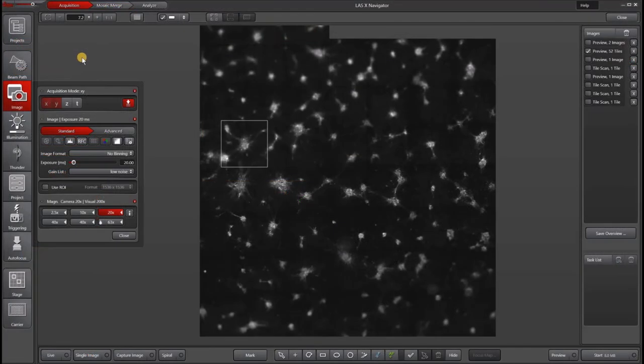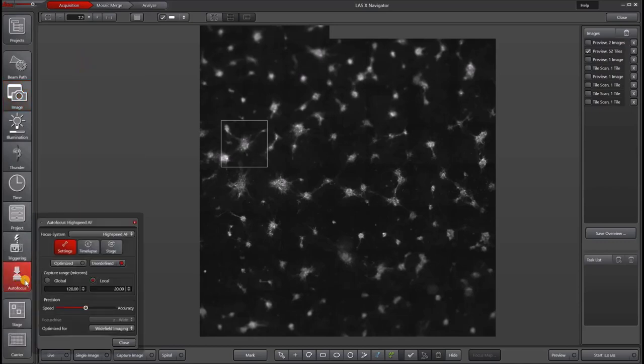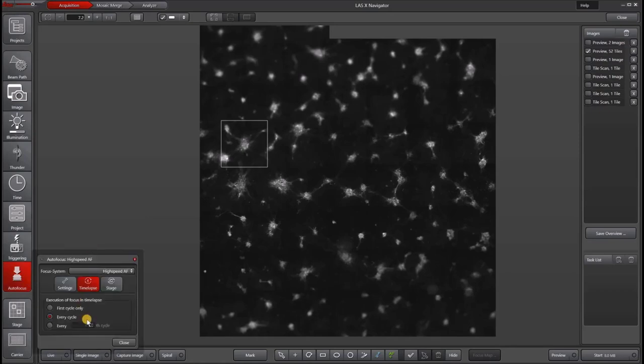Now let's see how autofocus works in Navigator or also when we add time lapse. There are two additional buttons on the autofocus channel that are available to you. One is time lapse and the other is stage. If you click T to add time lapse, you can go to the autofocus panel and click the time lapse. You can then choose to do an autofocus for only the first cycle, every cycle or every nth cycle.